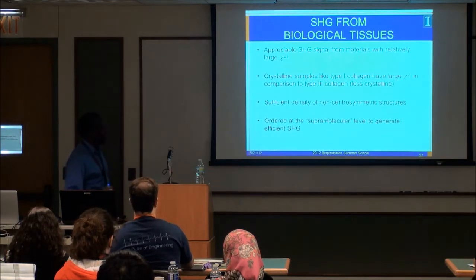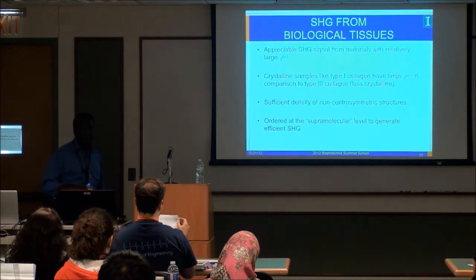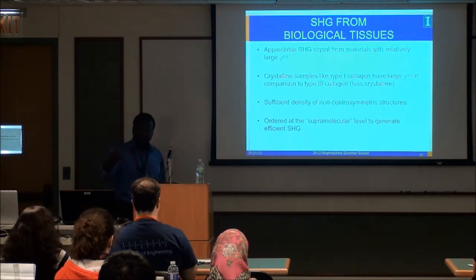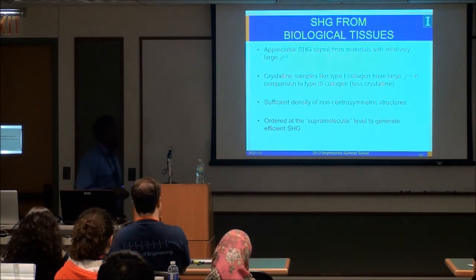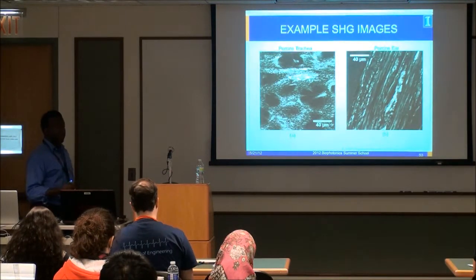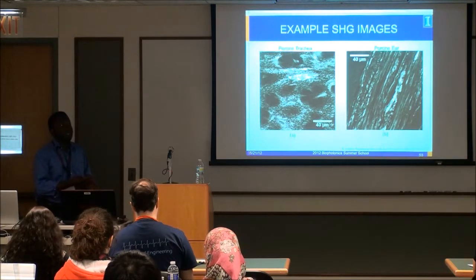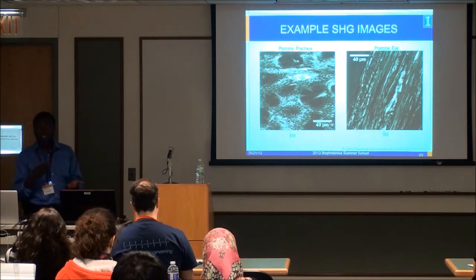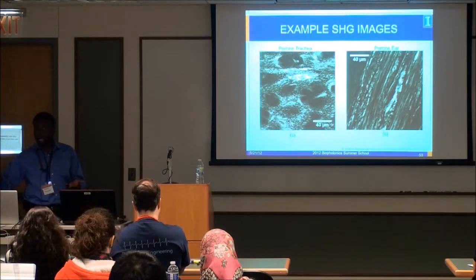To quickly say in 2, 3, 4 minutes, you can get second harmonic generation from biological specimens like type 1 collagen because it's highly crystalline. And now you can use that to image without introducing exogenous dyes. Some people introduce dyes anyway, right? If you introduce certain chiral dyes, you can enhance the SHG response. That's a possibility. It depends, again, on what your task is.